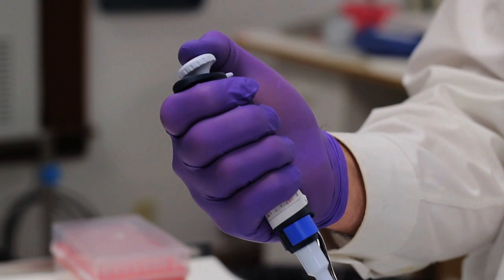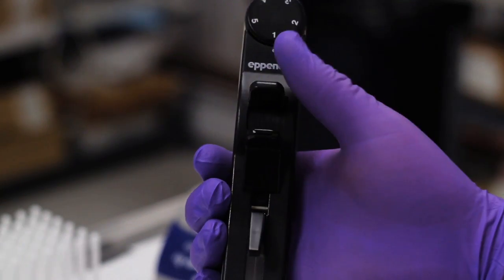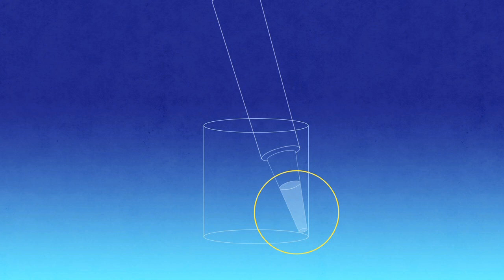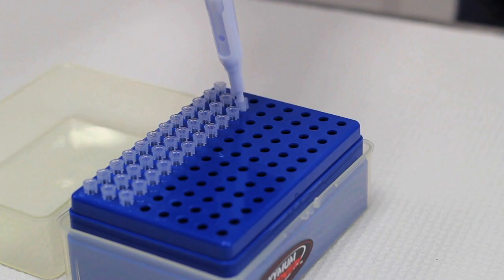Once again, make sure to practice good laboratory technique by using accurately calibrated pipettes. Do not submerge the pipette tip into the samples, but place it only deep enough to acquire the 50 microliter volume. Transfer the volume to the designated well by inserting the pipette tip into the lower corner. Make sure to use a fresh pipette tip for the next sample.